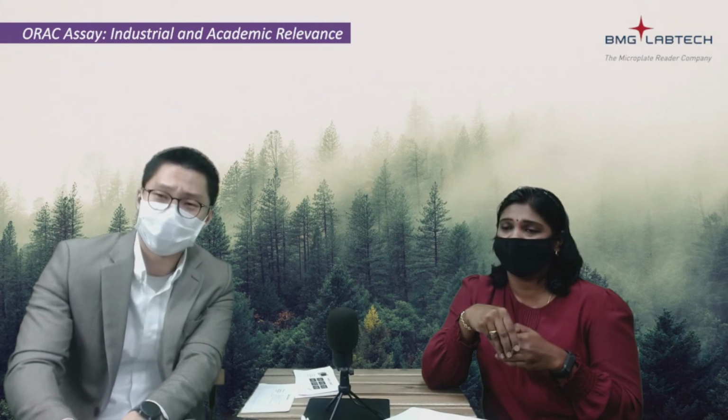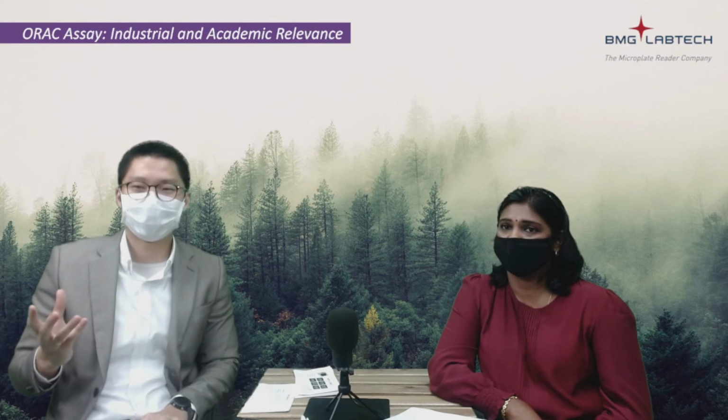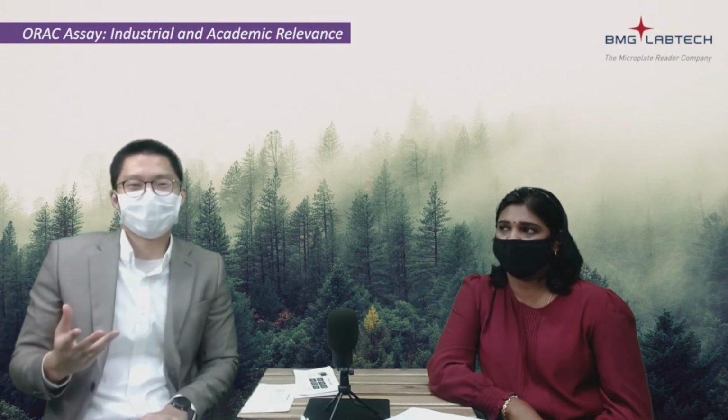In terms of the microplate reader technology, as I'm representing BMG today, I can explain a little bit as well. ORAC is a fluorescence-based method. DPPH is an absorbance-based method. Comparing similar assays, if you can choose a fluorescence method or an absorbance method, choosing fluorescence will always be more sensitive, because with absorbance, many things can affect the reading.